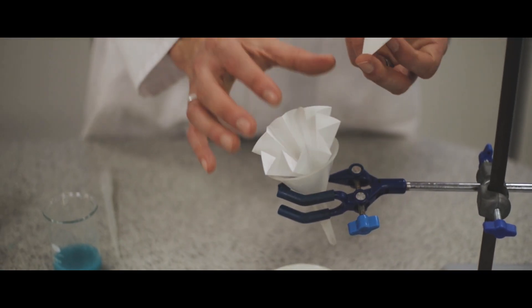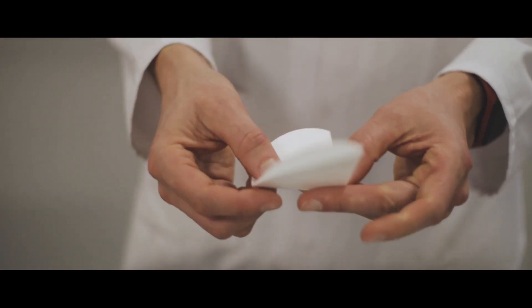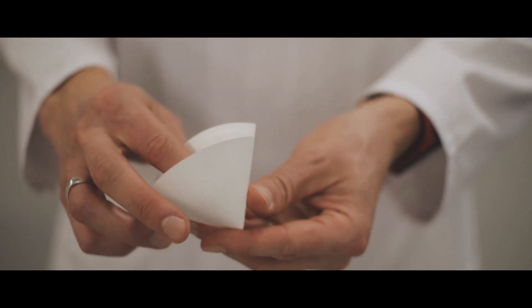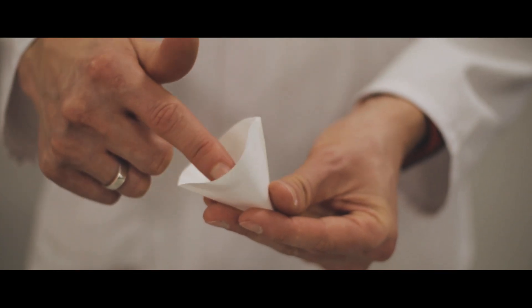So here I've got a funnel and I've got some filter paper. Now we can fold the filter paper in a couple of ways. We can fold it in half and in half again and open it up like so, but we really want as much surface area of the filter paper as possible.